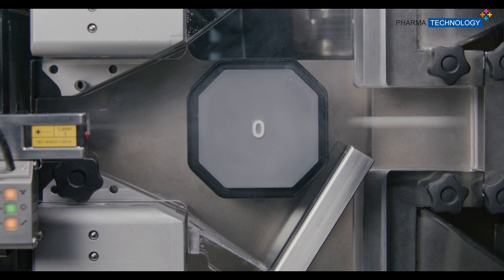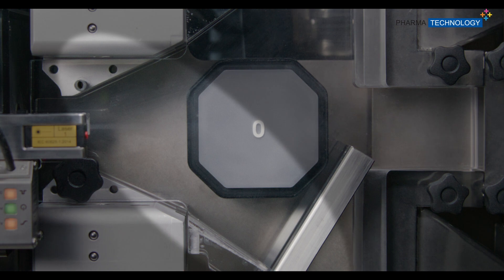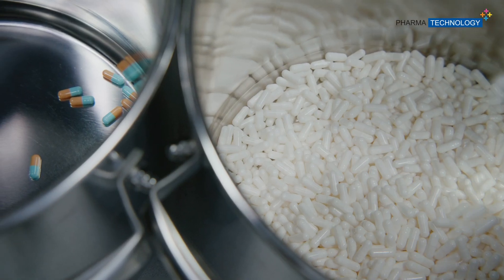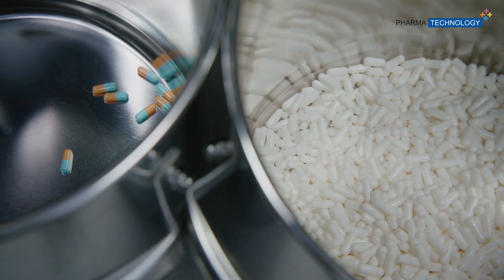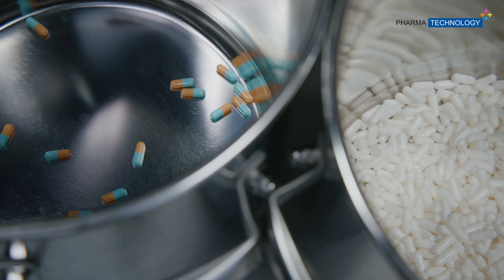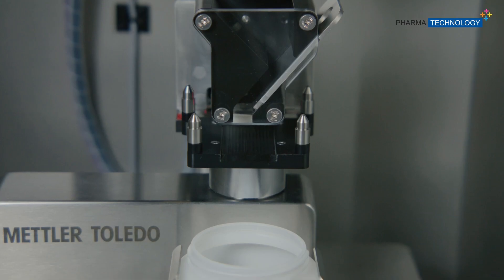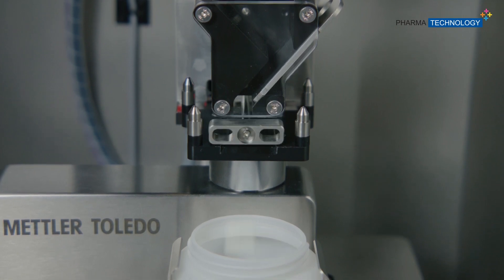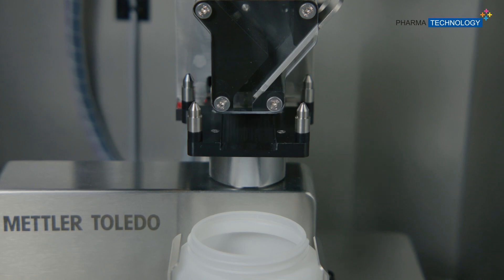As a result, out-of-specification products are instantly rejected, while correct ones are stored in the conformed product bin. In addition, a rejection confirmation sensor guarantees that non-conformed products are correctly discarded. At regular intervals, samples are deviated to the high-precision weighing cell to continuously adjust the aggregate calibration.